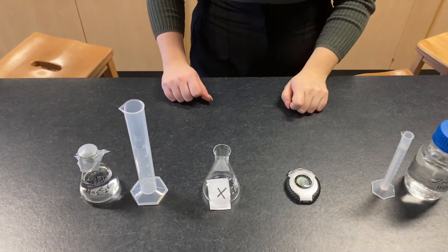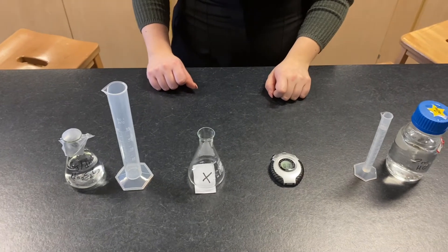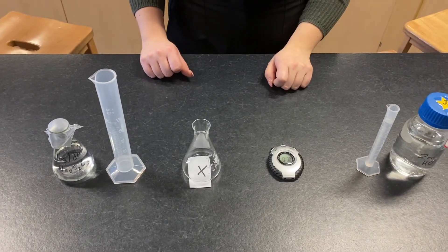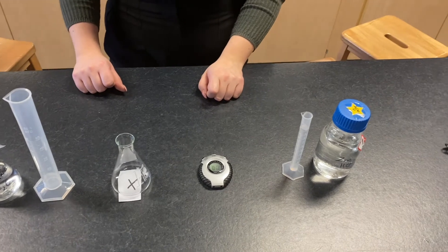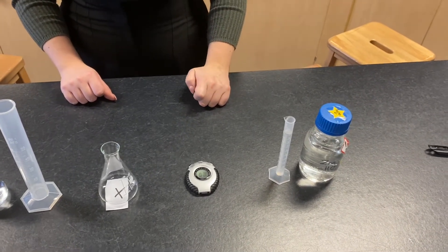So here we've got some sodium thiosulfate, a measuring cylinder, our conical flask with an X on some paper, a stop clock, and a 10 millilitre measuring cylinder for the hydrochloric acid.